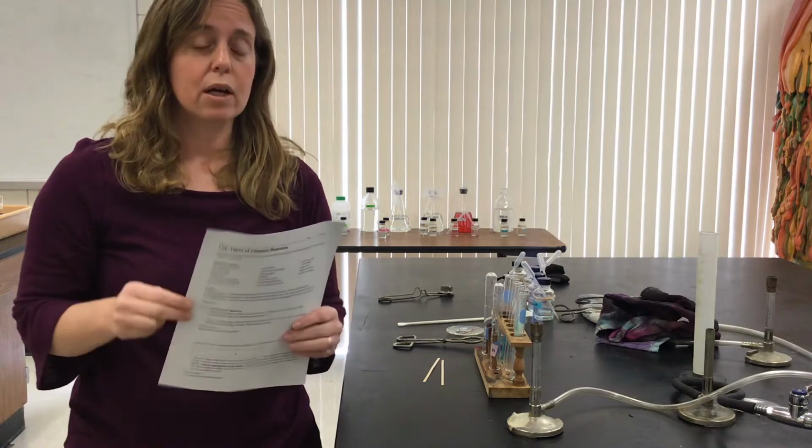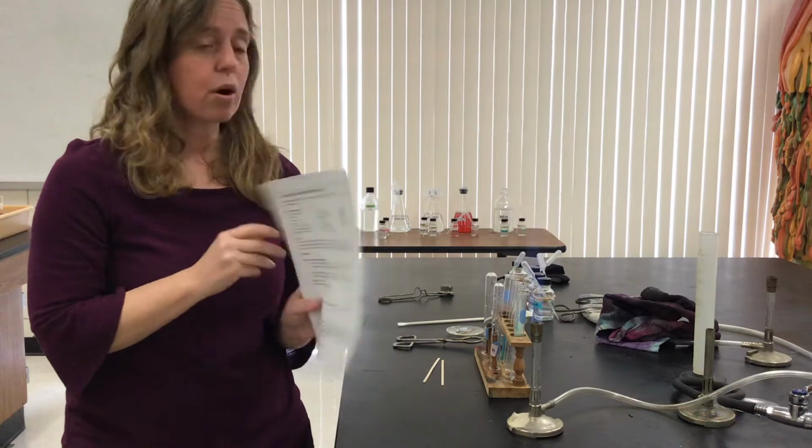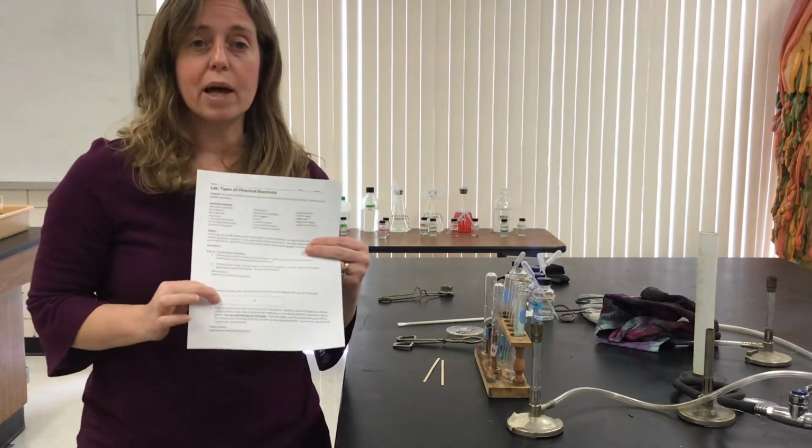Okay guys, so this is your types of chemical reactions lab that you're going to be working on. You should have gotten your handout in Google Classroom. You're going to be using Kami to type through the activity as we go along. And so there are some reactions that you're going to have to do in the boxes, and you will have to balance those and write the products.